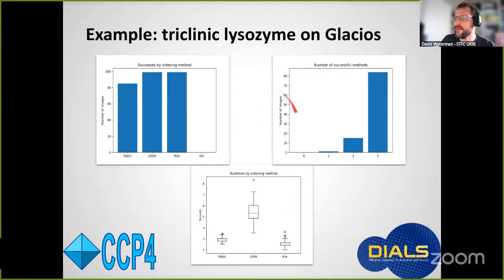But unfortunately, working with Marcus Gallagher-Jones at the RFI and with people at the Stockholm Group, I see real life success with other data sets to be somewhat worse than this. So it seems like we had a particularly good case, and I think it's quite sample dependent. The lysozyme crystal we had here diffracted very well, provided lots of spots, and that helps a lot with this kind of experiment.